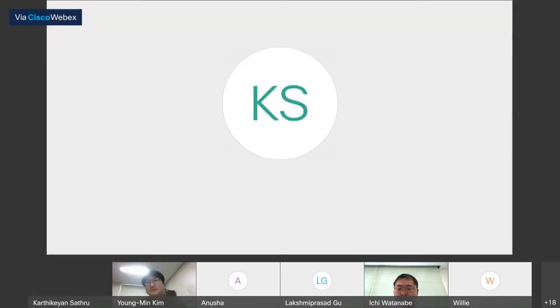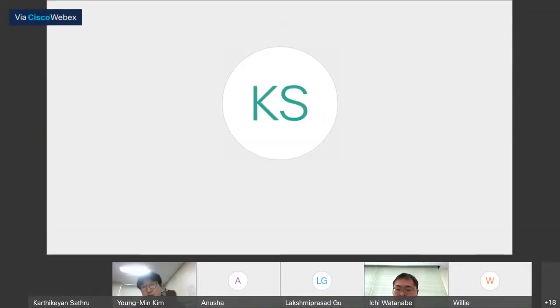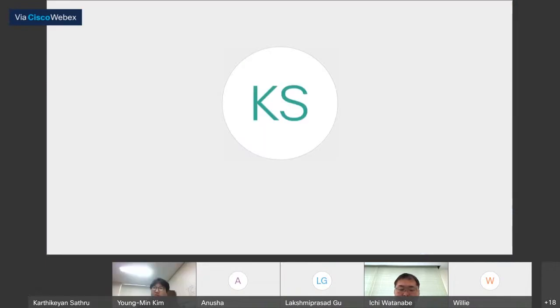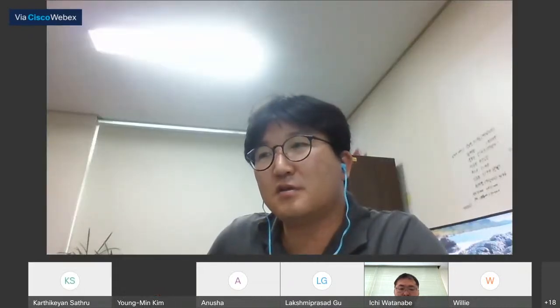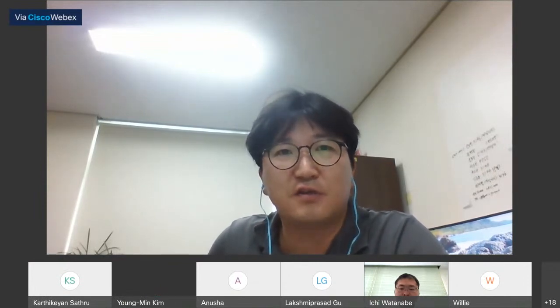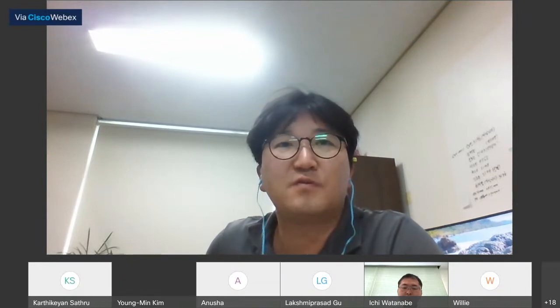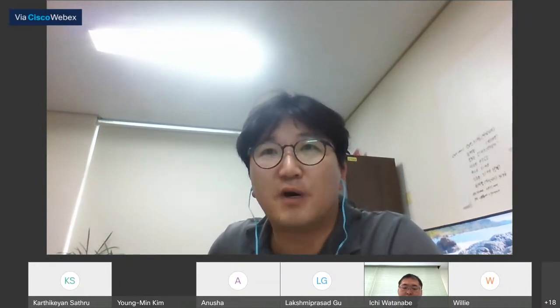Okay, yeah, so the next question is also connected. Can we get the product yield in percentage for oil, gas, and char after this application? Yes. Maybe can you explain a bit so that they know how that can be obtained? Yes. Gas yield can be calculated from the quantification result using the GC-TCD detectors. In case of oil, it's difficult. First, you have to measure the residual solid amount.